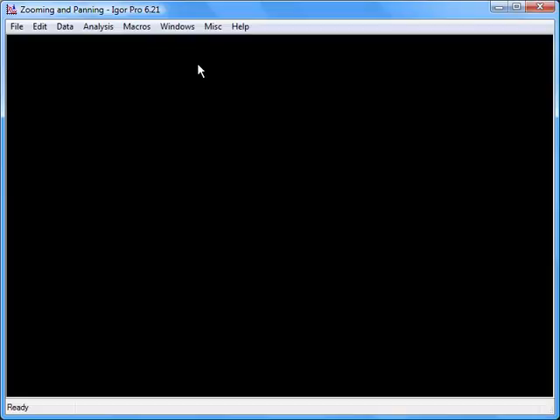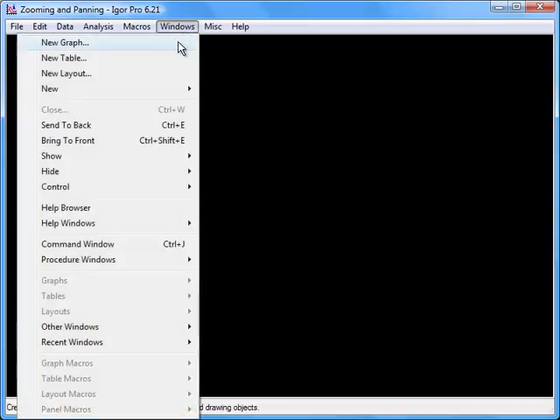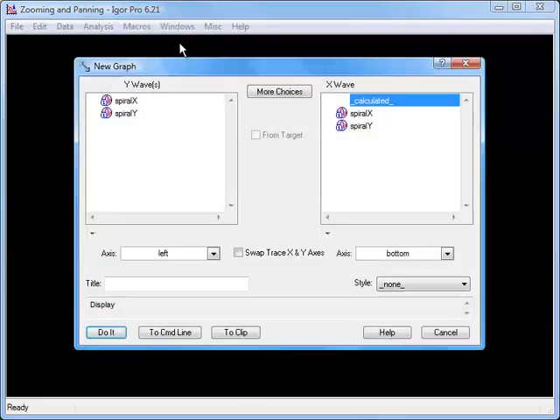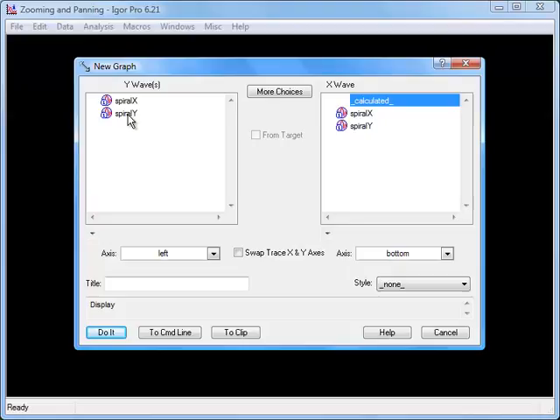First, choose the Windows New Graph menu item. In the dialog box, if necessary, uncheck the From Target checkbox. Next, in the Y Waves list, select Spiral Y.